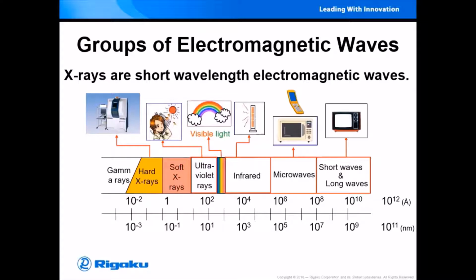The shortest wavelengths correspond to gamma rays. And then, the range from a part of the ultraviolet to the gamma rays is called ionizing radiation. When we use it, we have to follow the law, such as the Ordinance on the Prevention of Ionizing Radiation Hazards in Japan.